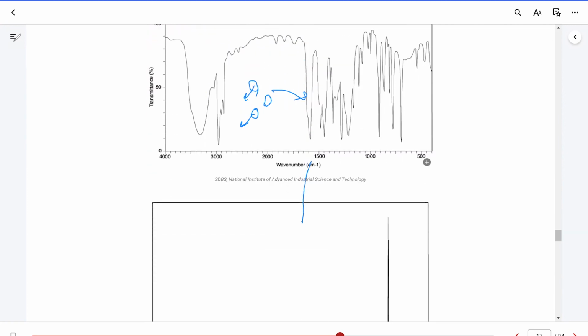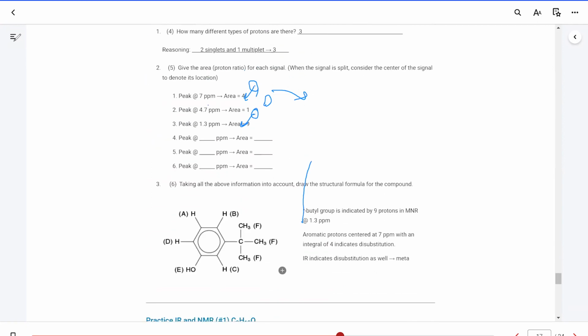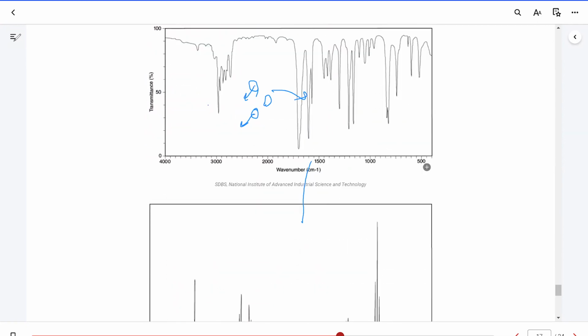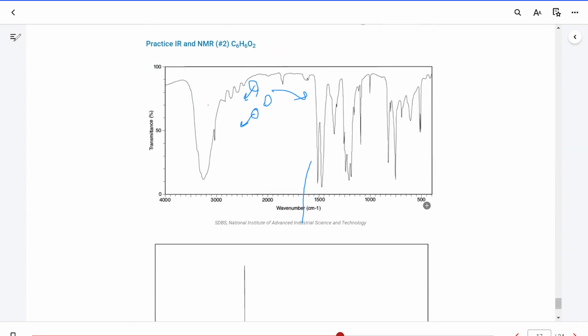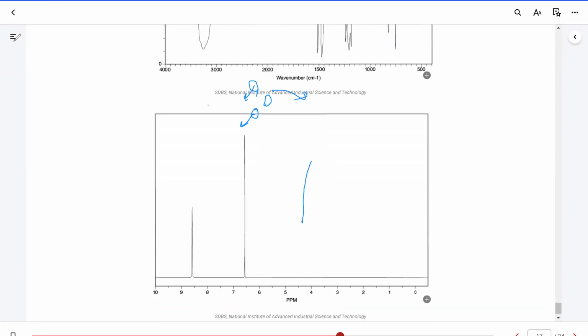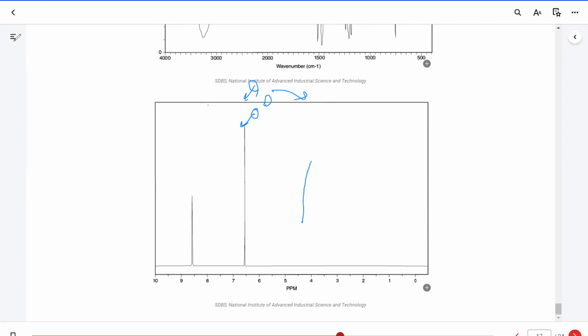Okay. So there's some help in interpreting the IR and the NMR. What is not present is not the solution. You have the solution, so please check the structural formula for the compound and decide which peak corresponds to which functional group or bond from that compound.